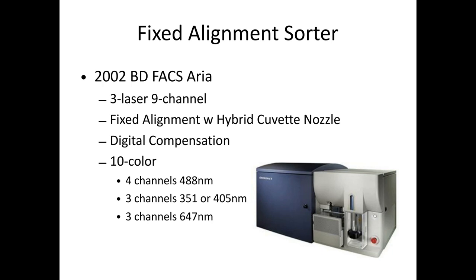We did CFSE staining for proliferation, and it turns out that there was something going on. And later we recognized that, even now there's publications, we call it sorter-induced cell stress. And we did gene profiling to show, sure enough, it turns on a lot of genes if you sort something in conditions beyond what it was meant for. But my big lesson was, wow, you can't tell a big multinational company that their flagship product doesn't work like they're expecting it. And I caught a lot of negative vibes by presenting that to BD.